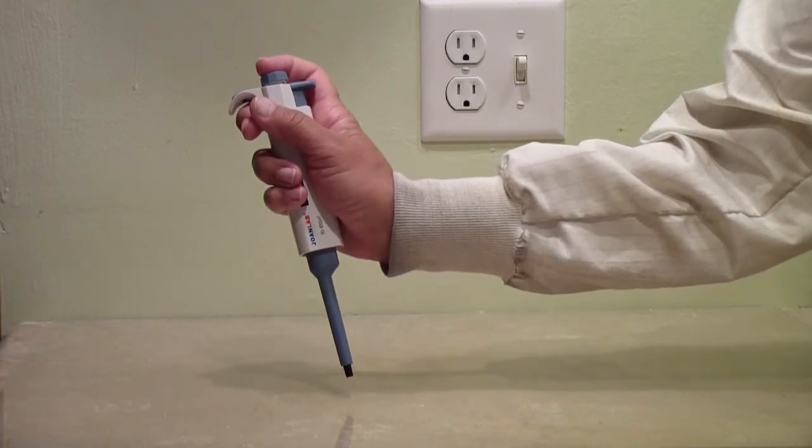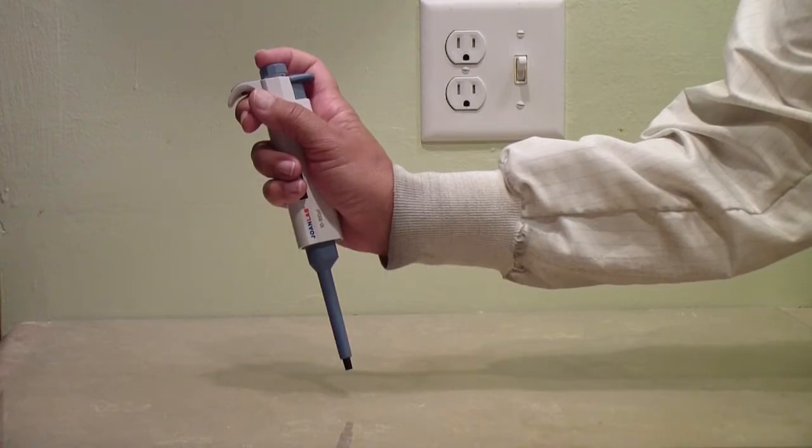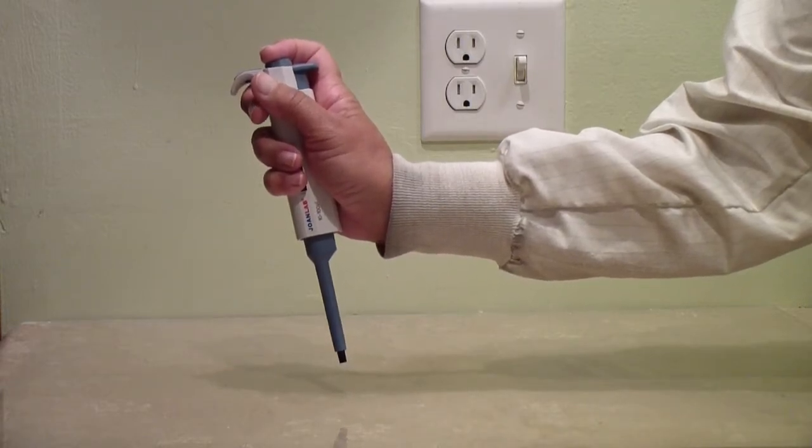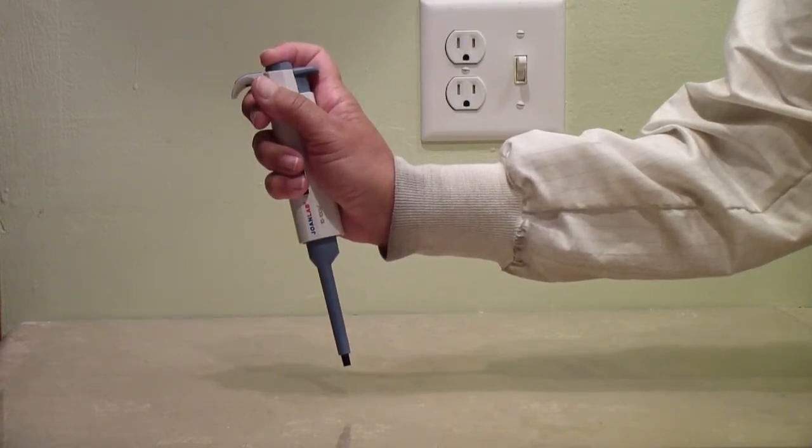Press gently down on the plunger. You should feel it come to a stop. This is called the first stop. If you press down harder on the plunger, you will feel that it can go down even further, all the way down, which is called the second stop.